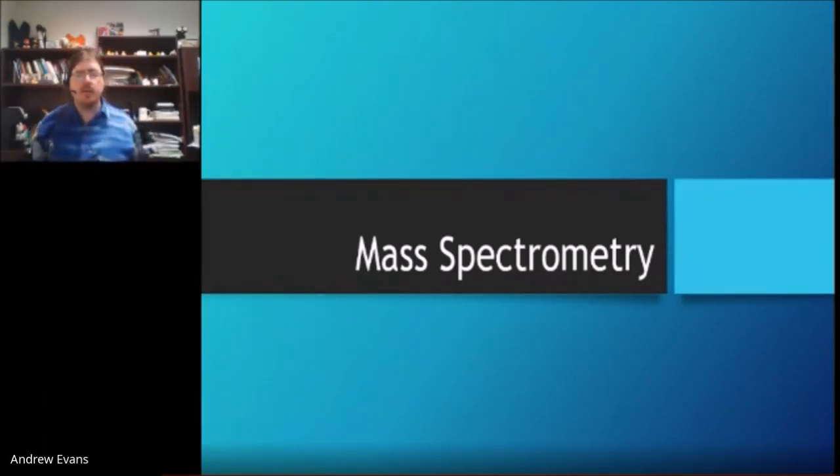Unlike most techniques we look at when we usually think of chemistry, we think of thousands and thousands of molecules, each one adding up to give a total average. Mass spectrometry is a little bit unique in that we look at individual molecules at one given time. So when we look at an isotope, we are truly seeing that isotope and not a mixture of isotopes.